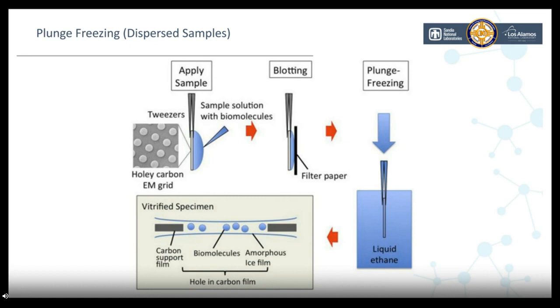But for bulk materials, if you're preparing for FIB, this cannot always be the best option because it's quite thick, and also that means it might not hold on to the tweezers, it might not fit with the whole system.